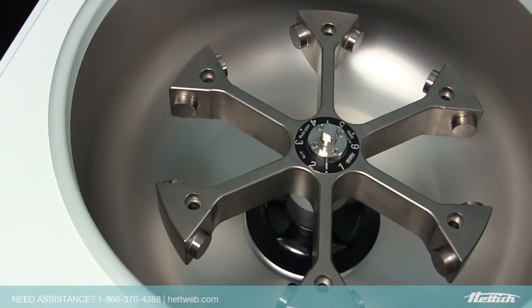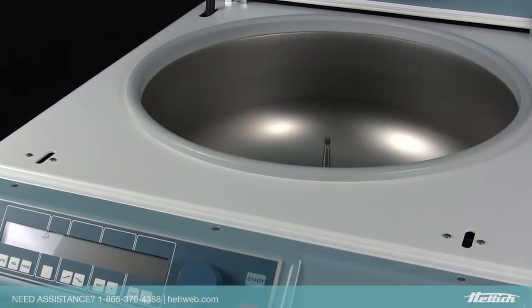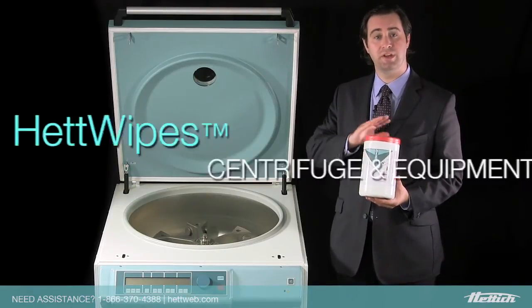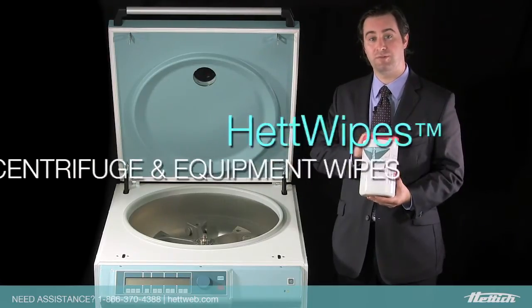Without a windshield getting in the way, the Silenta is easy to clean and maintain by simply lifting the removable rotor and wiping the surgical-grade stainless steel bowl. The centrifuge chamber can be cleaned using Hettich's own HettWipes, which are non-corrosive disinfectant wipes designed specifically for your Hettich centrifuge equipment.